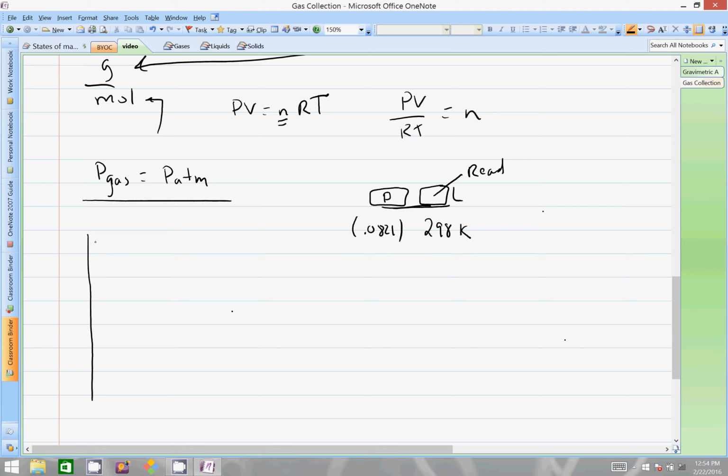Just a big picture, literally the end of that gas collection tube. So here's the water, and here are the gases above it. These particles are flying around, hitting walls, bouncing, and another particle flying around, hitting wall, bouncing, and there are enough collisions with all the particles in here literally to push the water down.